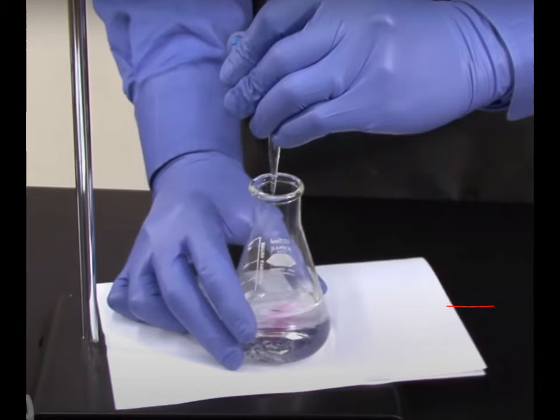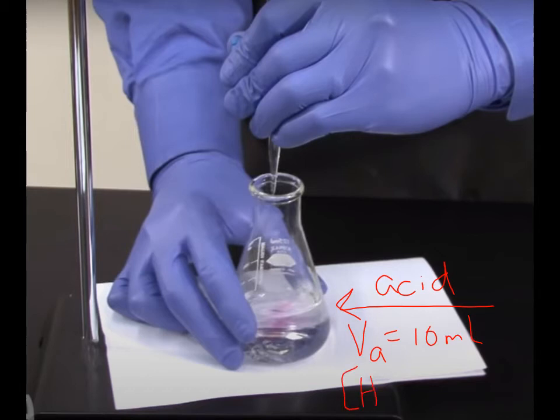Now he's actually titrating the sample, and let's take a look at the different parts of this picture, what's going on. So down here in this flask, this is your acid. And before we started, we measured the volume of that acid. We know what that is. Let's say it's 10 milliliters. Let's just pick something. What we don't know is the concentration of the acid. The whole point of the experiment is to find out what the concentration of the acid is. That's what we're after.